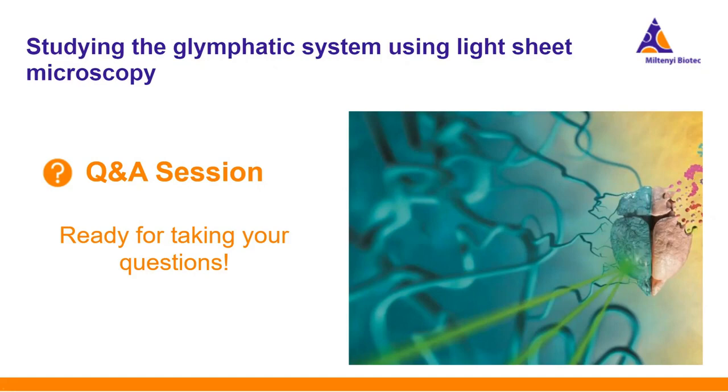So it's really useful when you have larger samples, such as mouse organs, or even if you want to image the whole mouse body, because there you get a much improved resolution compared to, for example, CT or MRI imaging. So this is really the advantage: the improved resolution for larger samples.